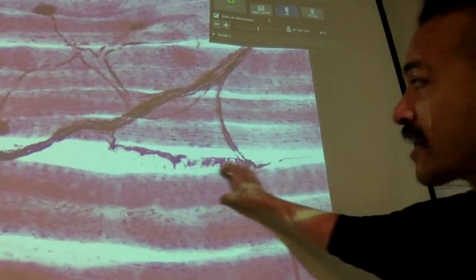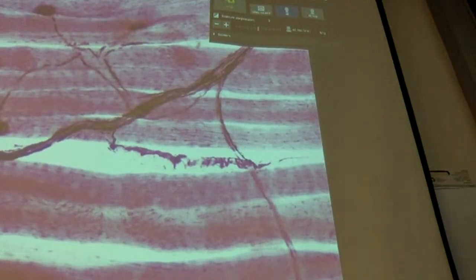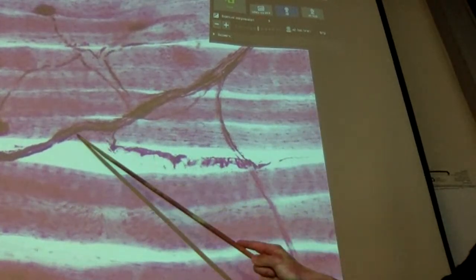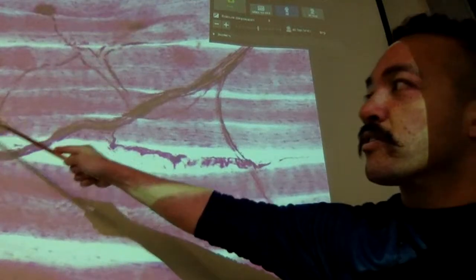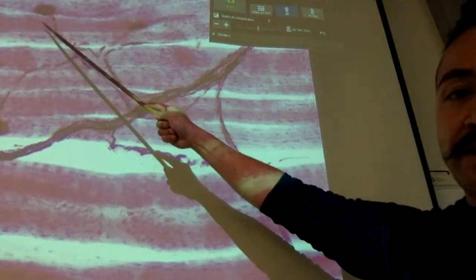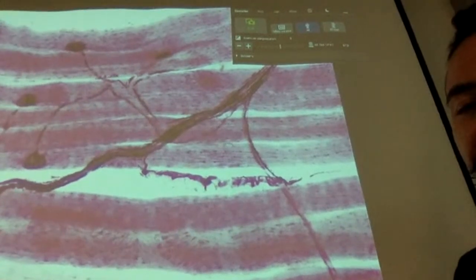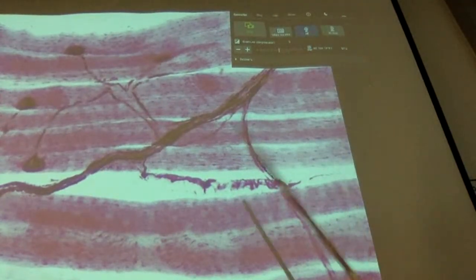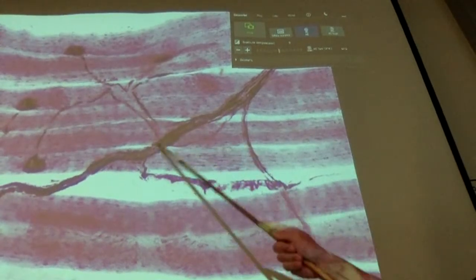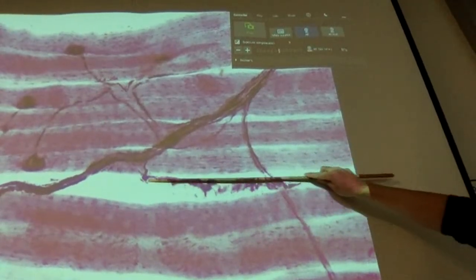We've got skeletal muscle in longitudinal section. We've got an axon and axon terminals. So these are axons of somatic motor neurons to control everything going on here. But here we can see a branch of something coming off of this bundle, and then coming in between these fibers, and it's much thinner.